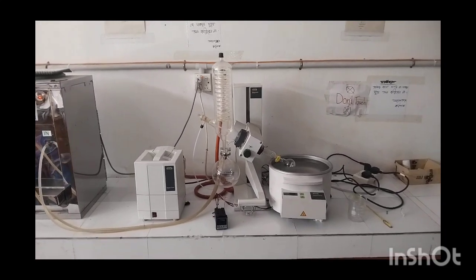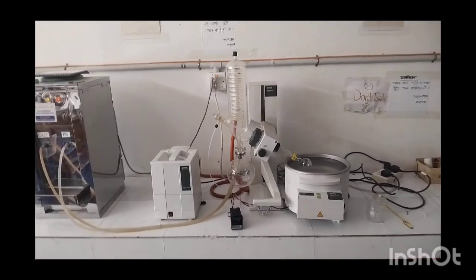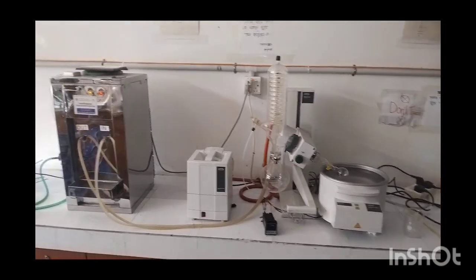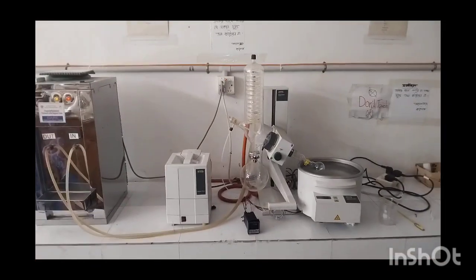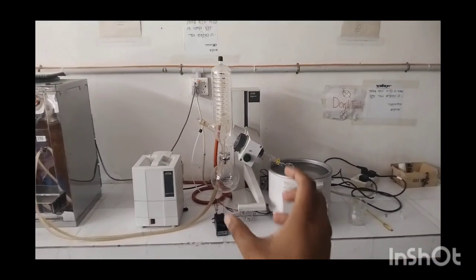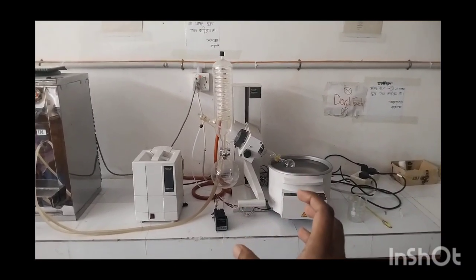By means of using this specific operating system, we will be able to get rid of different kinds of solvents. So with a view to dry our mixture in the RB bottle, we will use this specific operating system.